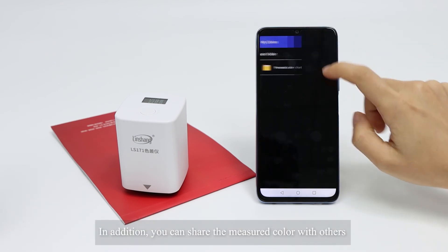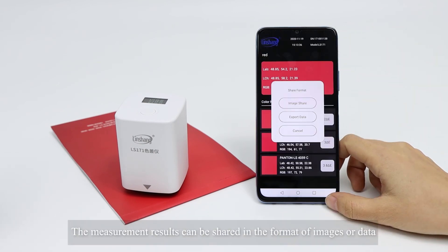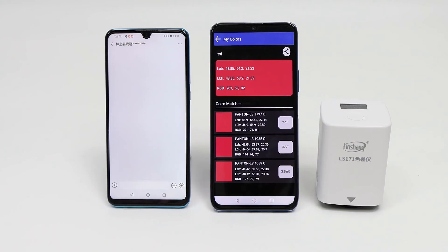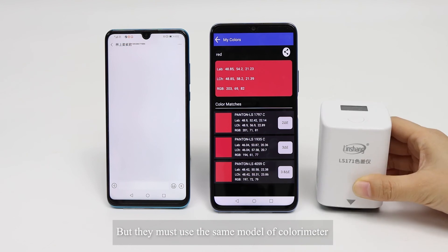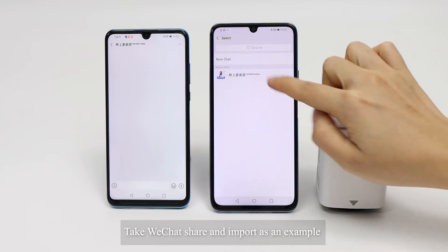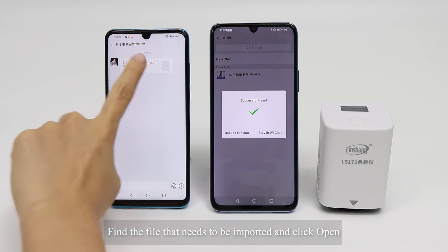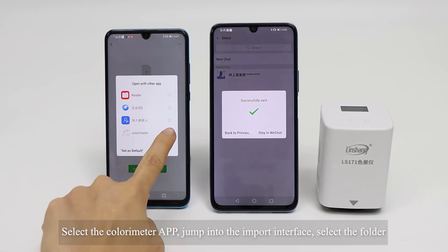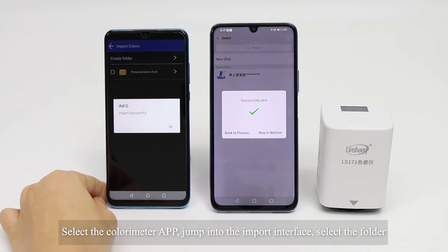You can also share measured colors with others by clicking the Share icon. The measurement results can be shared in the format of images or data. Users can also import colors shared by others into their own app, but they must use the same mode of colorimeter. Taking WeChat share and import as an example: find the file that needs to be imported, open it, and select the colorimeter app. The mobile phone will enter the import interface — select the destination folder.